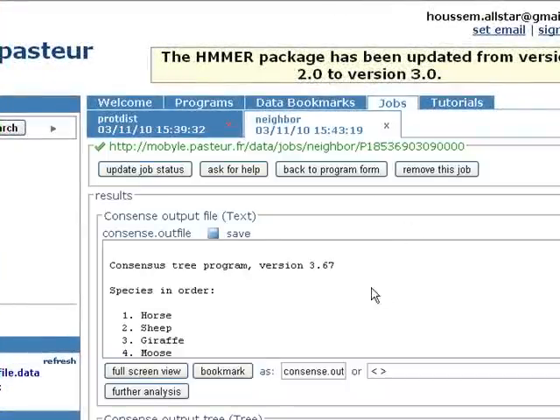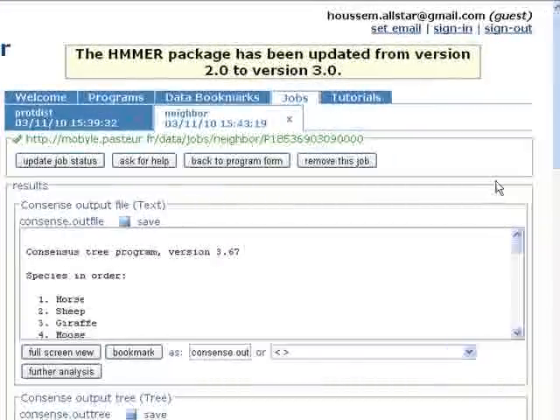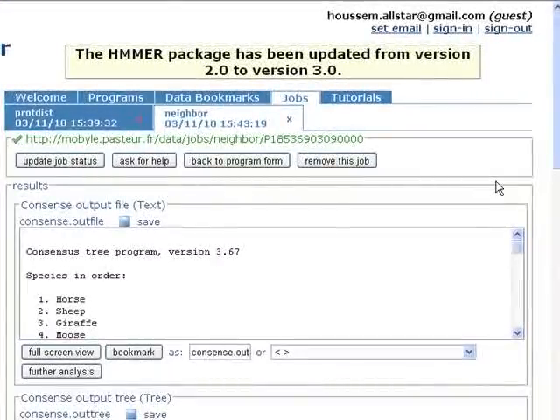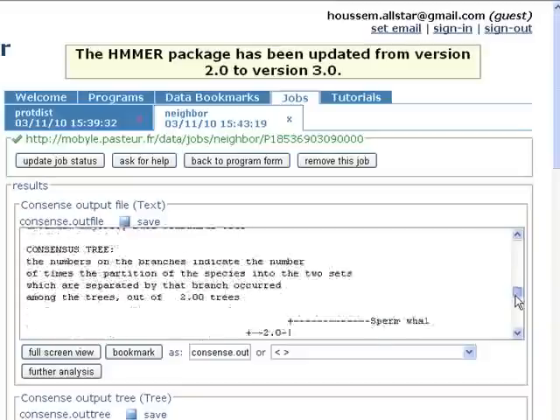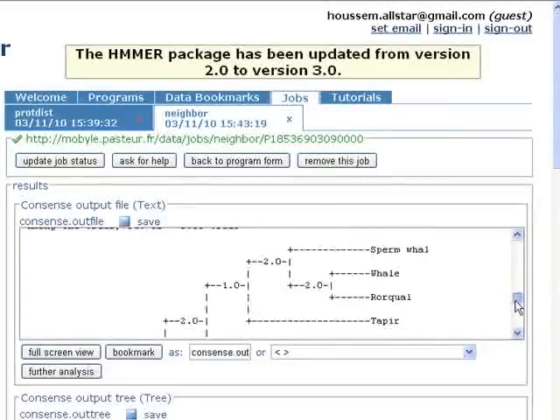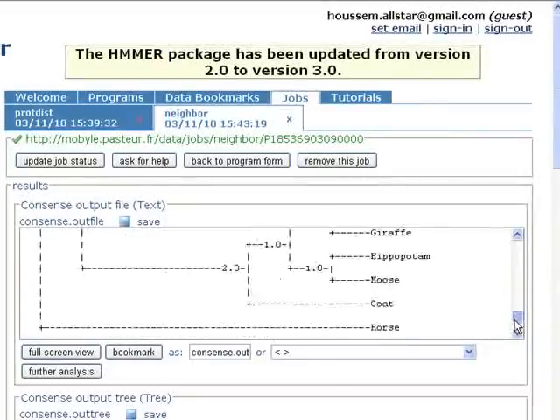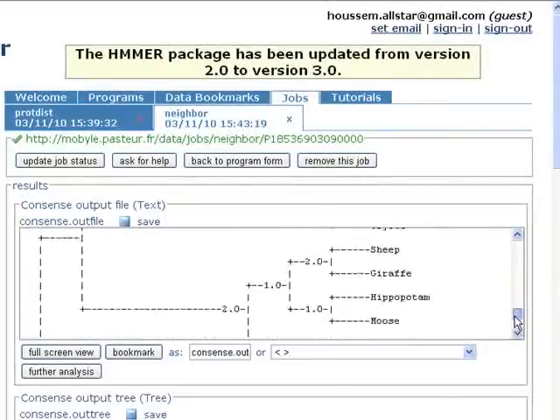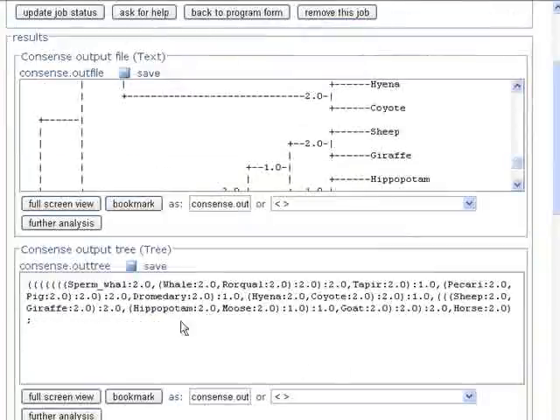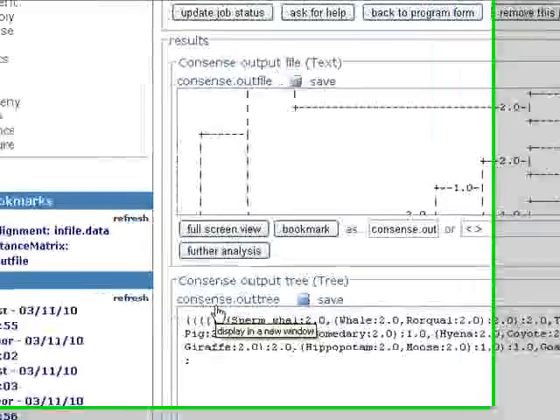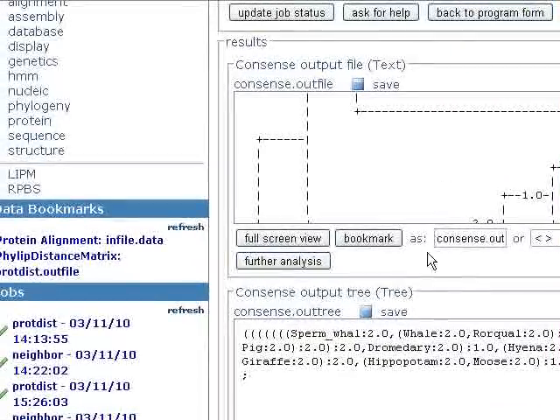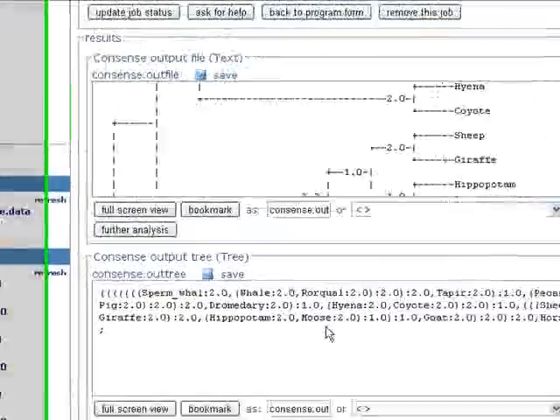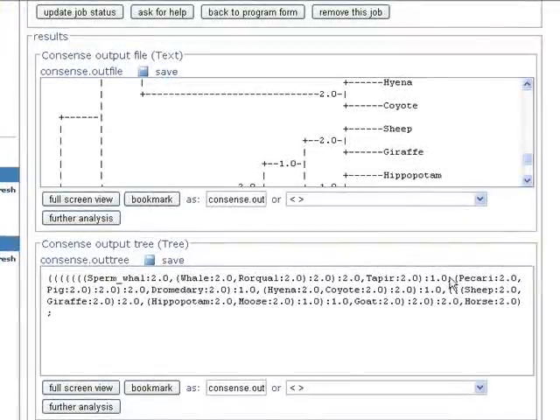Okay, here is our final result page. Here the constancy.out file is our file that contains our phylogenetic tree. For example, the constancy.out tree is the same tree as this but it's in another format which is the newick format.